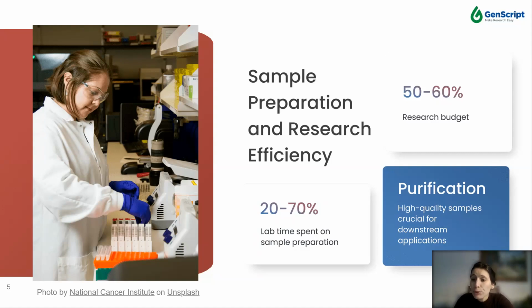Furthermore, this is also going to be extremely prohibitive if you don't have high quality samples and a good purification process that you're implementing. So purification, as well as a high quality and crucial setup, is going to be very important for this success.